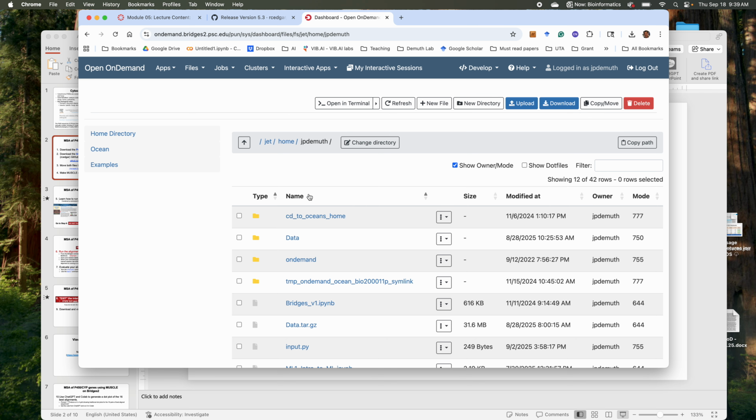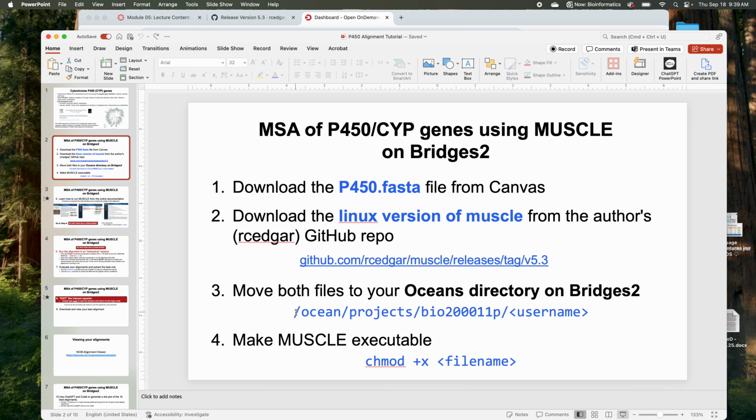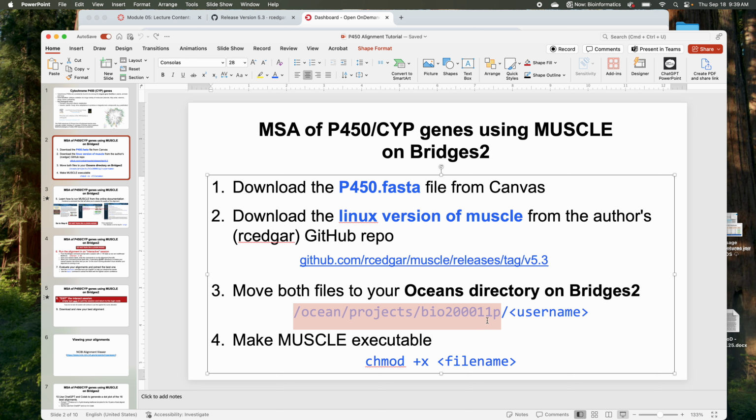Because this is our login home. I've given you the path to your home directory on Ocean.